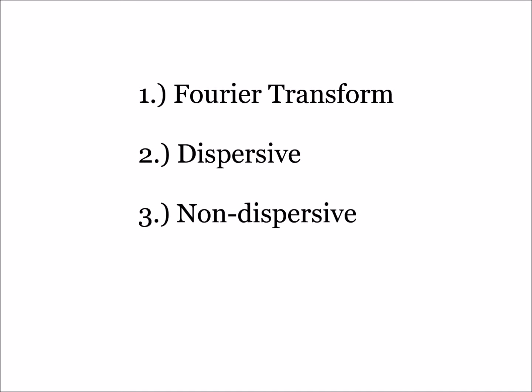The three most common modes to perform infrared spectroscopy are Fourier transform, dispersive, and non-dispersive spectrophotometers. This video will discuss Fourier transform spectroscopy, also known as FTIR spectroscopy. More specifically, the theory, instrumental components, and advantages of FTIR spectroscopy and spectrometers will be examined.